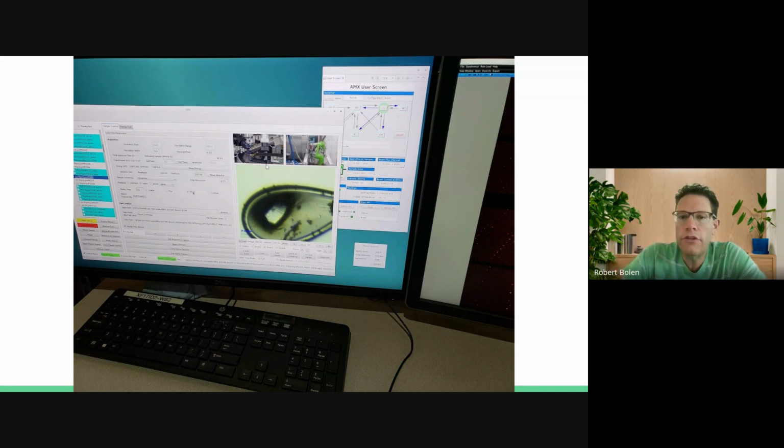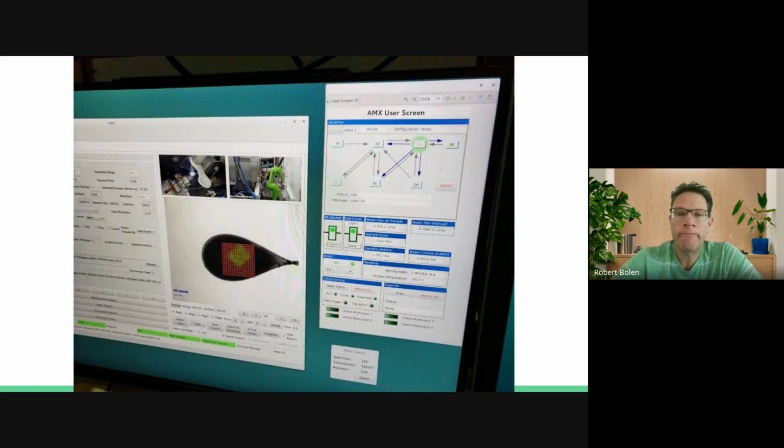And so what we'll do is we can use the computers to precisely position the crystal so that the X-rays can hit it. When the X-rays hit that crystal, hopefully we get a beautiful diffraction pattern. And before it does that, the computer tells you where it seems to have picked up good diffraction. So you'll actually get a grid that the computer will generate over the crystal, and it highlights hotspots where, based on the diffraction that came through, the computer has detected that there is some sort of diffraction. And then it's up to us as the scientists to determine whether or not that diffraction is actually good diffraction. Do we have a good pattern, or is it just ice, or just background noise?